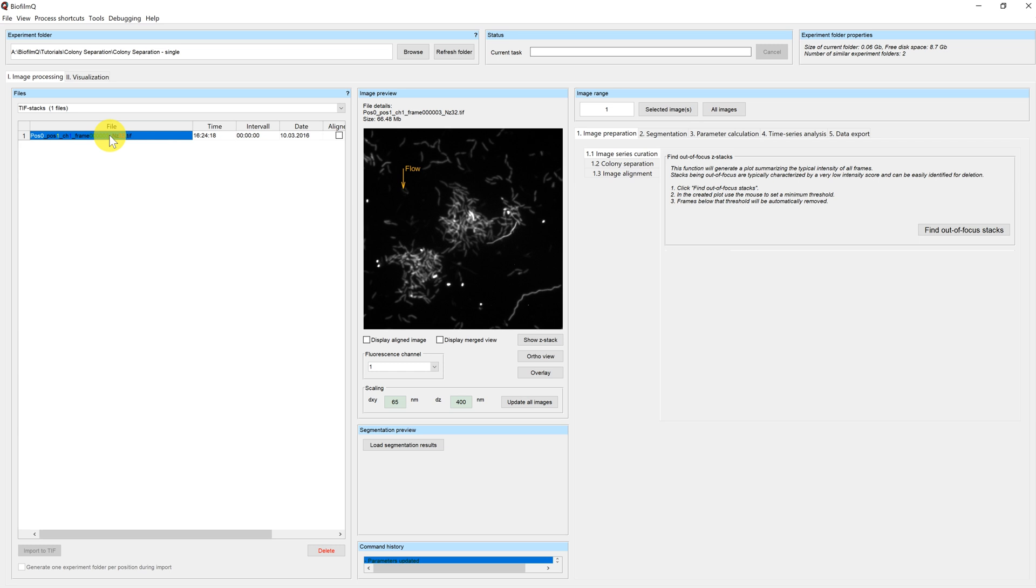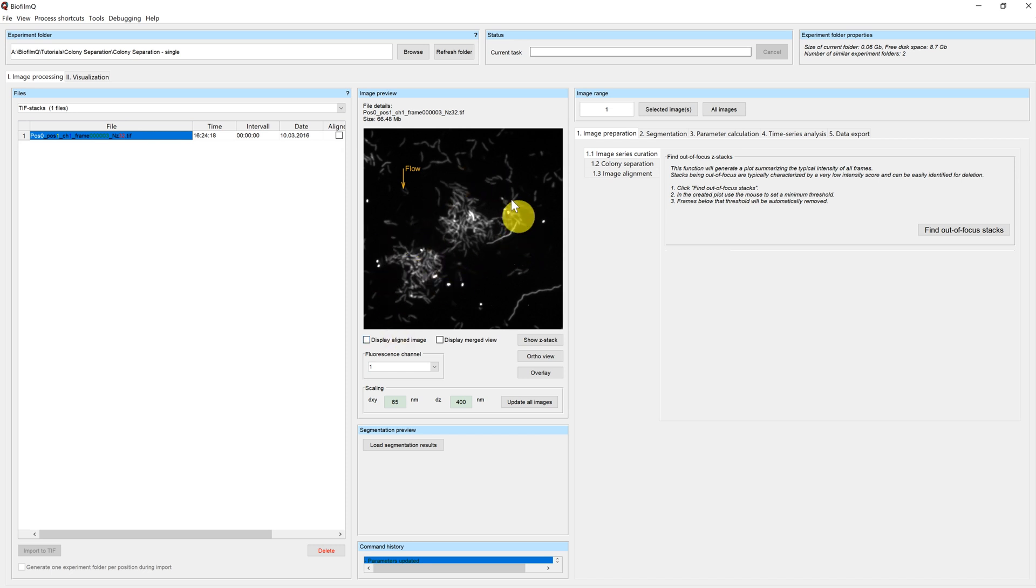Here I have an example of a single microscope image imported by Biofilm-Q. You can see that in this image two microcolonies are growing next to each other.